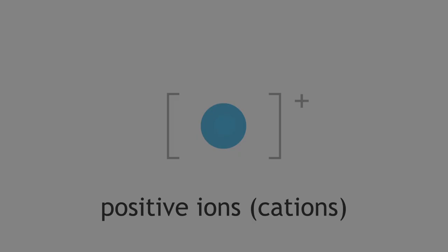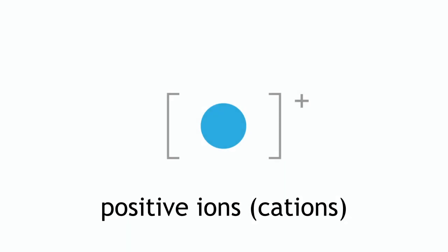Fireworks are a very important part of human celebrations. The bright colors and patterns of the displays never cease to amaze and entertain across generations and societies. In this lesson, we will learn how to test for positive ions, using the idea of fireworks as our learning base.